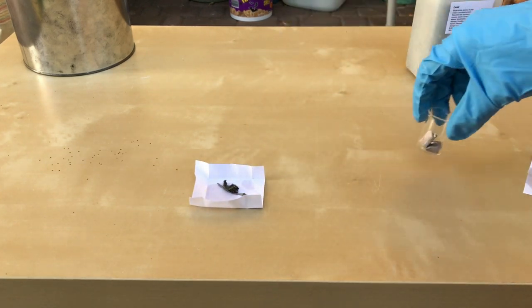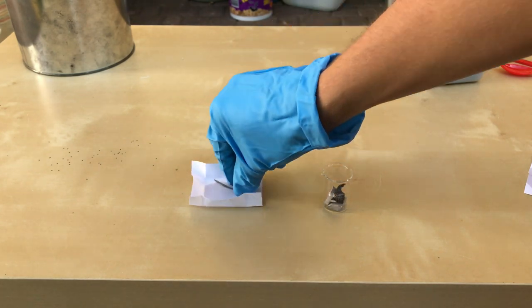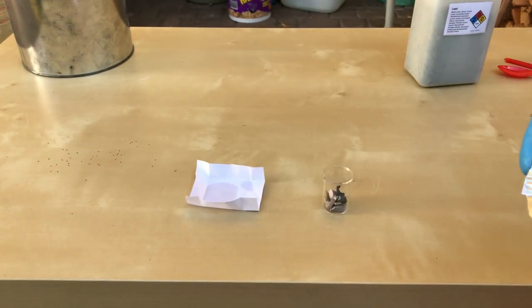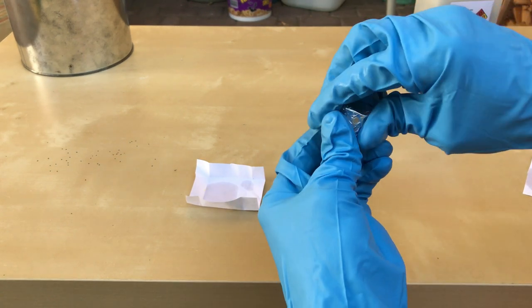The reagents were weighed out in advance and all of the reagents were added to a small beaker. To limit the amount of oxygen entering the beaker, it was covered in aluminum foil.